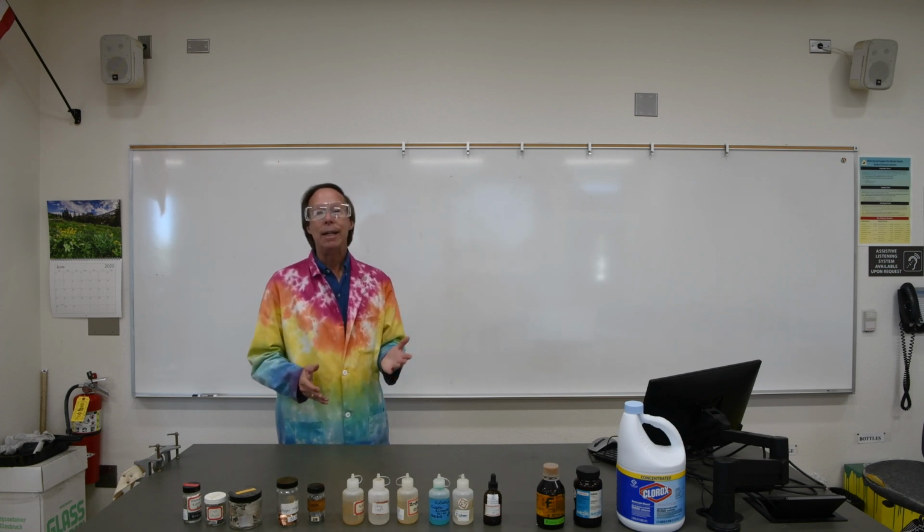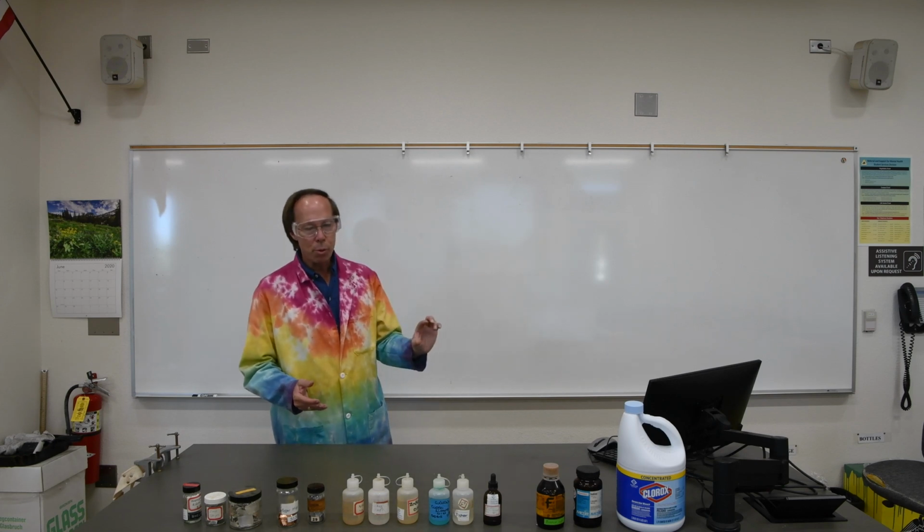Now this is probably the most complicated experiment of the semester in terms of analyzing the data and answering the questions. I've prepared a pretty thorough pre-lab video, so after our brief introduction here, make sure you watch that video, and then we'll head on over into the lab, carry out the chemical reactions for both parts A and B, and then you can use that information to answer the questions at the end of the experiment.